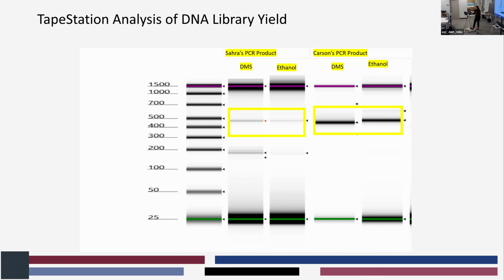First, I performed PCR2 using a successful PCR product prepared by my mentor. I obtained a reasonable result, which showed that the PCR was working. Next, I performed PCR1 using cDNA prepared by my mentor. Again, I got a reasonable result, which showed that PCR1 was also working. Based on this, we narrowed down that the problem is in the MAP reverse transcription step.